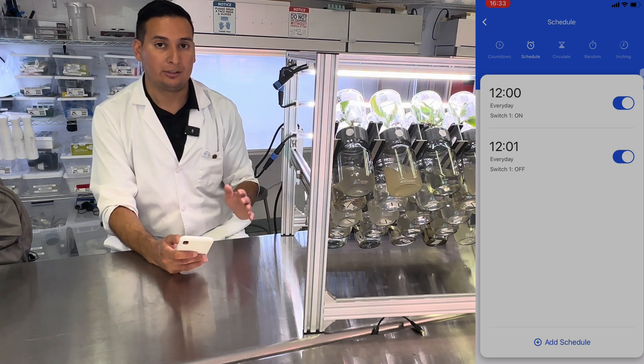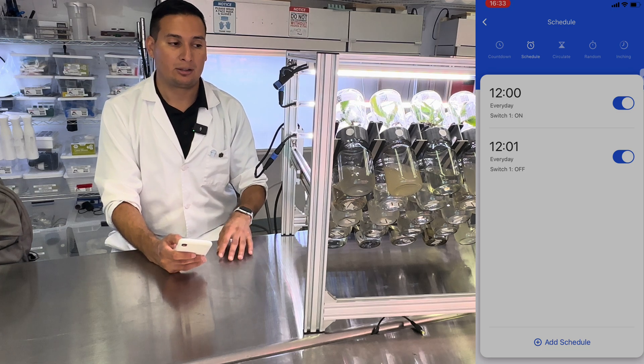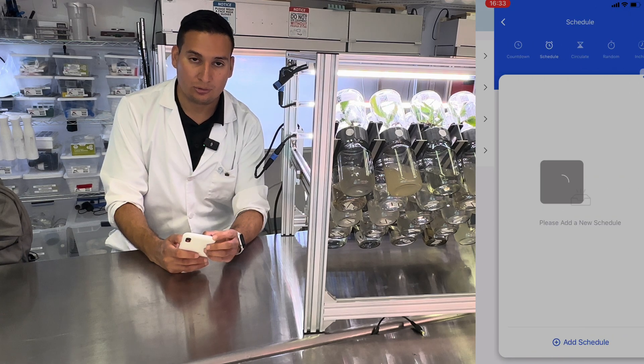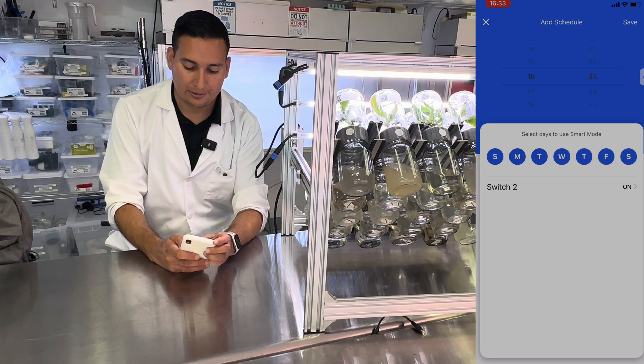This is going to flip the BioTil one way. Next, we need to make it return to the original position. To do that, we need to program switch number two. Add a schedule for every day.